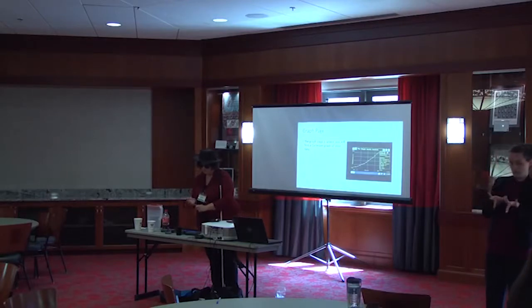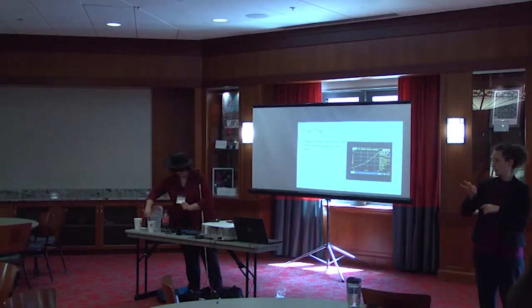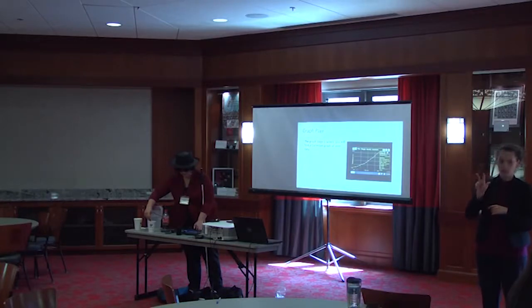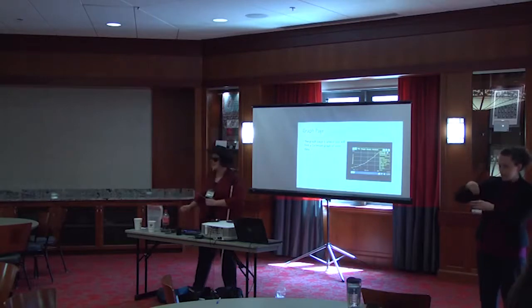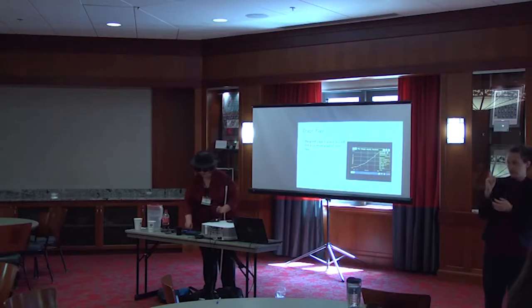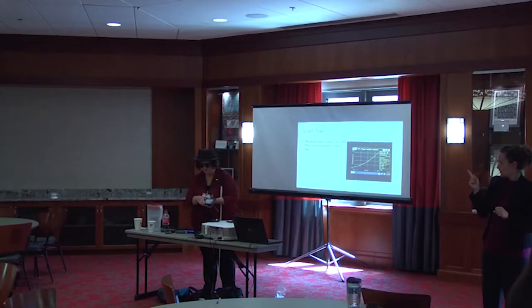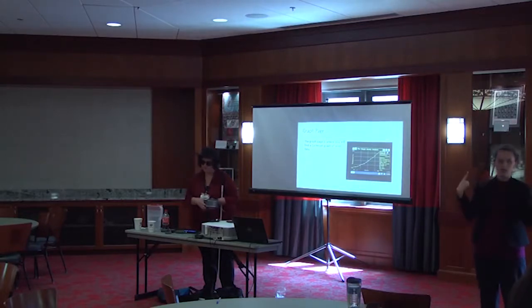Menu. File. Menu. Graph. Menu. Sonify. Menu. Start sonification. Menu item temperature. Run. Push button. Run selector. So we can hear until about 50% of that graph it went up, and then I stuck it in ice water and it tanked. So we can get that out of that, as well as if you have a student that prefers tactiles, you can also work with an embosser and make a raised line of this graph as well.